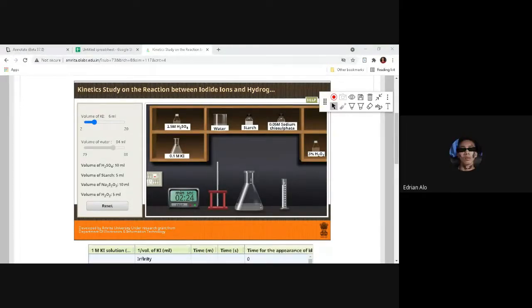It's bubbling now, it's producing gas. Really, Jude? Watch it, you'll see. It's their imagination, ma'am. Yes. Okay, that's it. The evolution of bubbles is one indicator that the reaction has occurred.